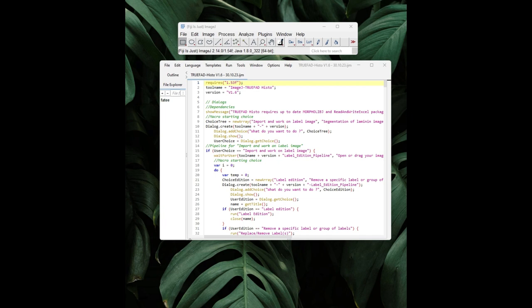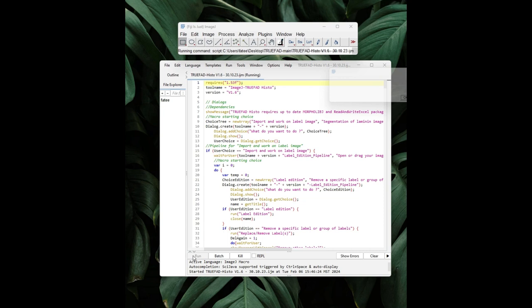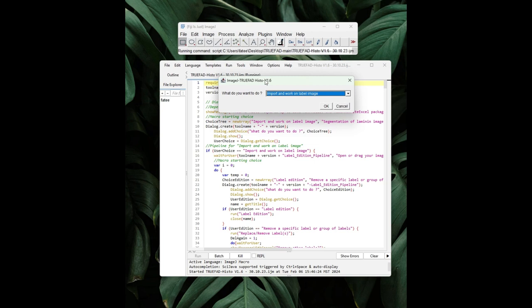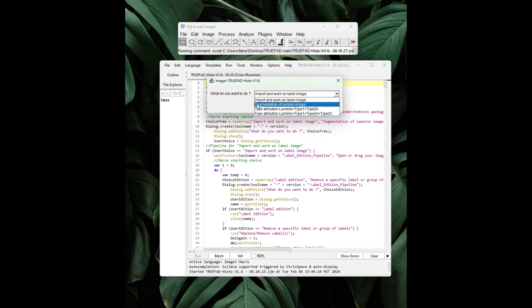Additionally, an empty folder will be created for the results files. To begin, you drag and drop the Trufad Histo plugin and click Run. There are four options available after the first window, depending on your objective. For example, you have Import and Work on a Label Image, which allows you to work on a previously processed label map. There is Segmentation of Laminin Image, which is used to segment fibers using laminin or another fluorescence channel. And there is Type Attribution Laminin Type 1 plus Type 2a, which includes segmentation and labeling of type 1 and type 2a fibers.